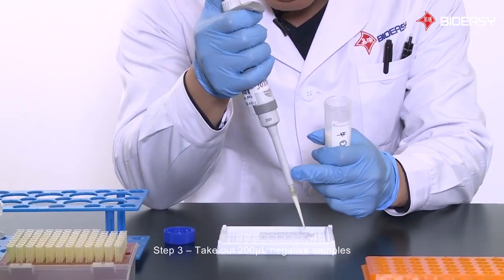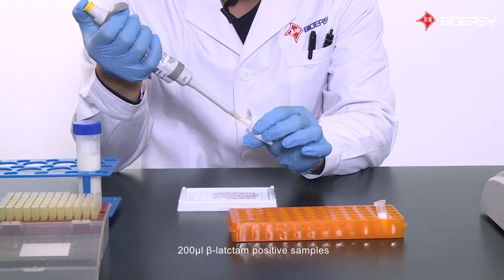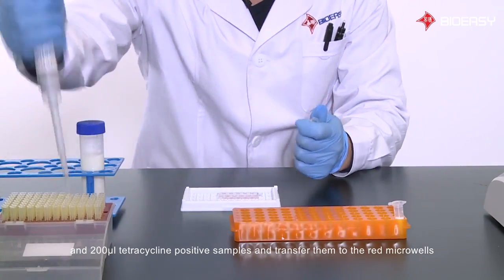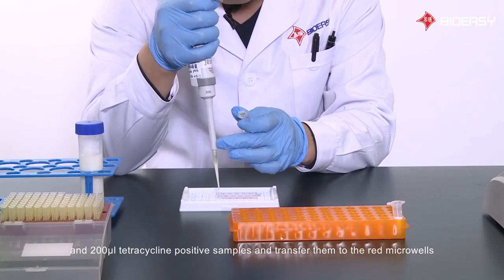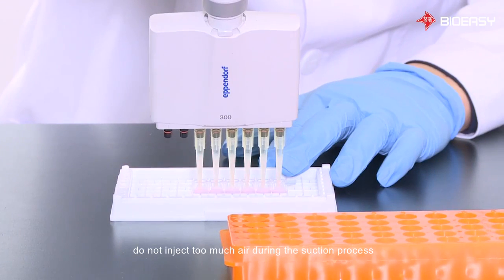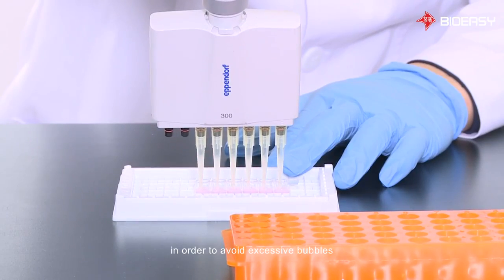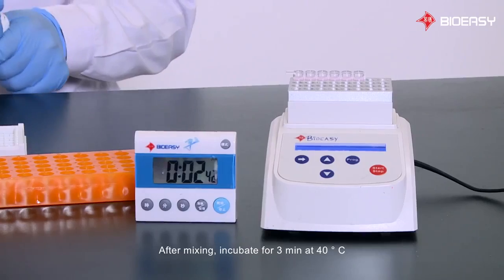Step 3: Take out 200 microliters of negative samples, 200 microliters of beta-lactam positive samples, and 200 microliters of tetracycline positive samples, and transfer them to the red micro wells. Mix with a multi-channel pipette 4 to 5 times. Do not inject too much air during the suction process in order to avoid excessive bubbles. After mixing, incubate for 3 minutes at 40 degrees Celsius.